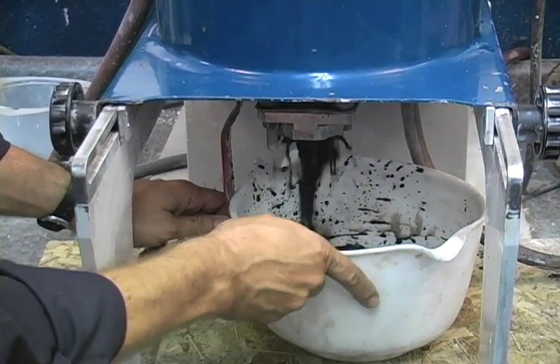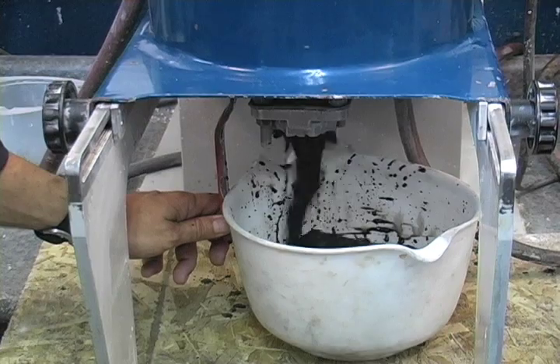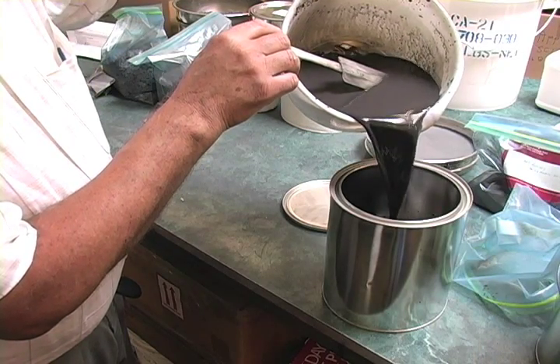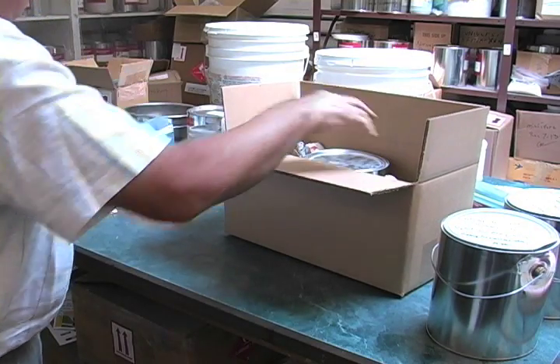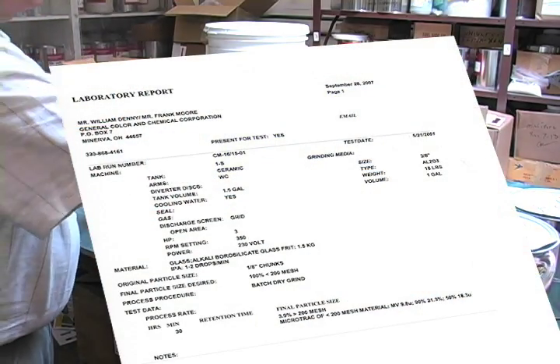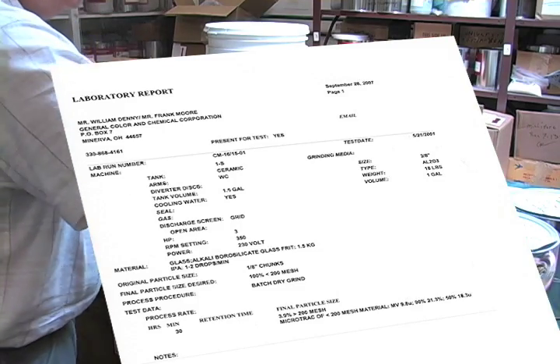Once the test is complete, the remainder of the sample is discharged from the mill. The balance of the customer's sample is poured into a container and prepared for shipment back to the customer. The final lab report is included with the package or emailed to the customer.